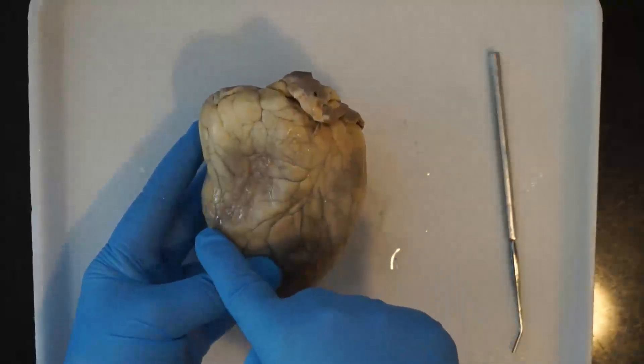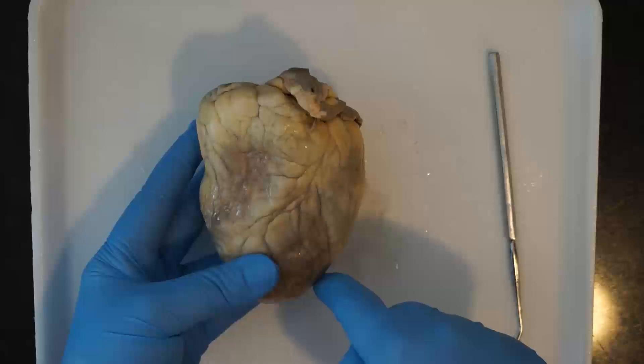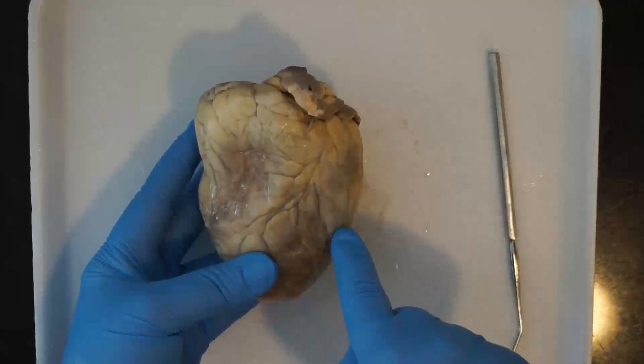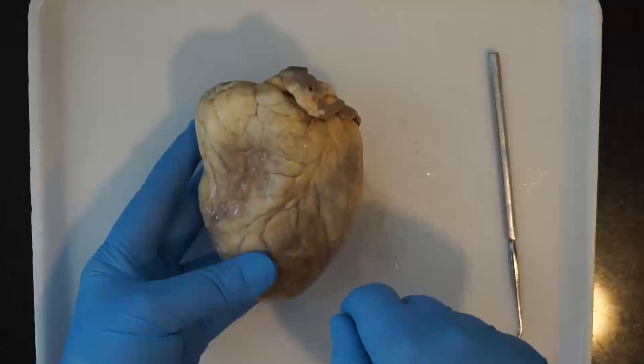The right side of the heart is actually on your left, and the left side of the heart is on your right. That's simply because it's the sheep's left and right side rather than yours.